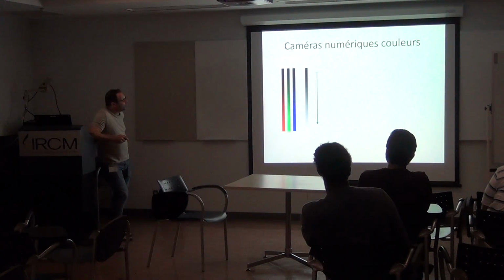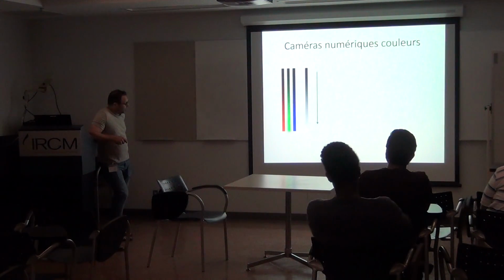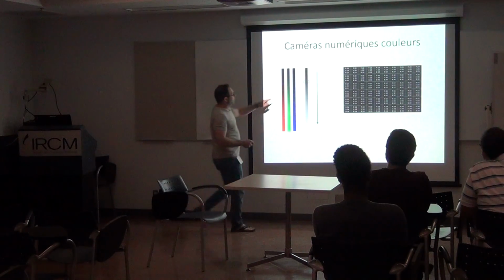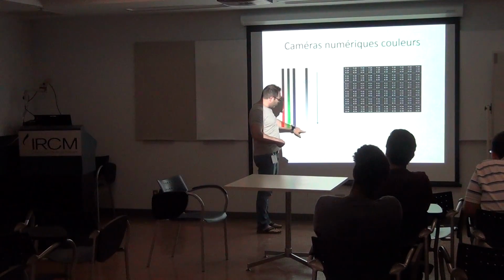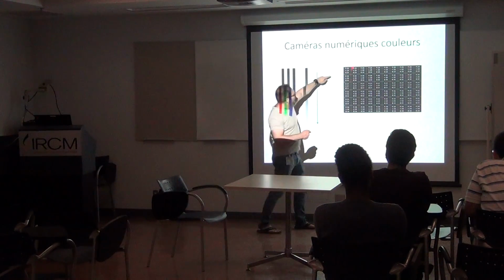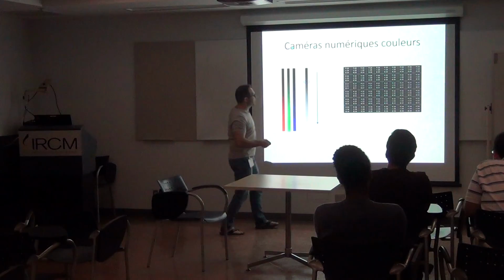So a digital camera would have red, green, and blue components for color, or you can have only a gray array. Okay, and so the value there, black would be 0 and 255 would be white. So in between, 128 and below this would be, let's say 29, 30, 31, 32, 33, 34 would be this range here.